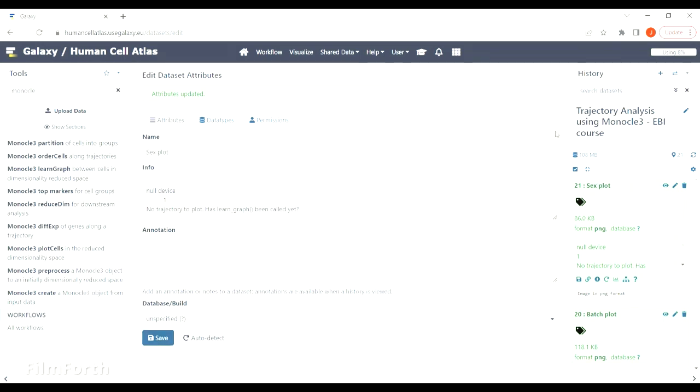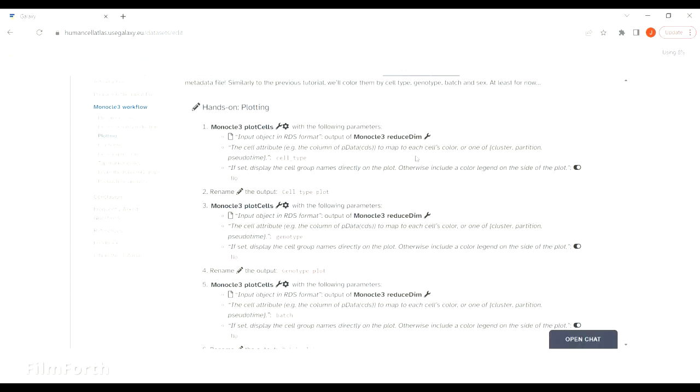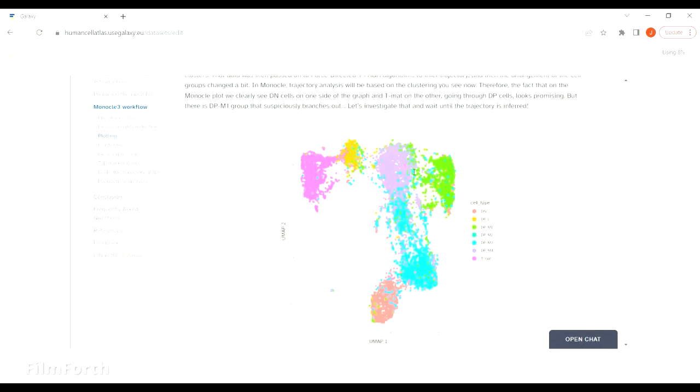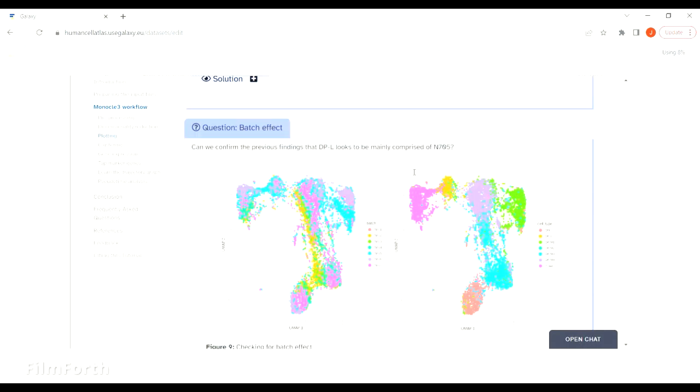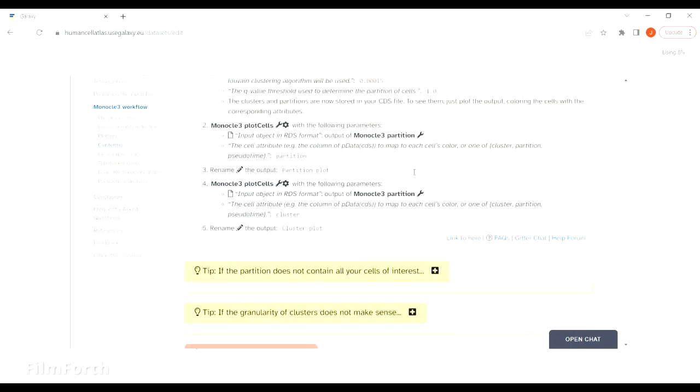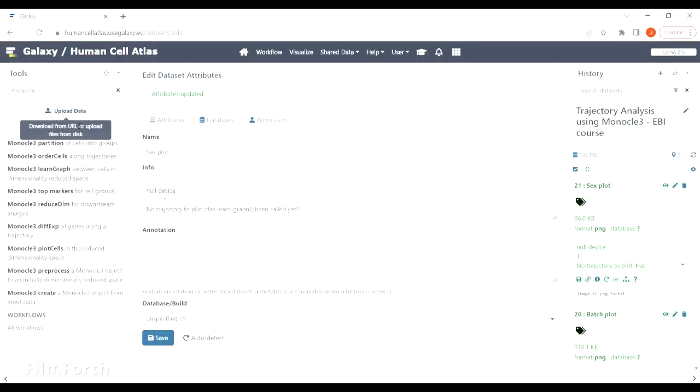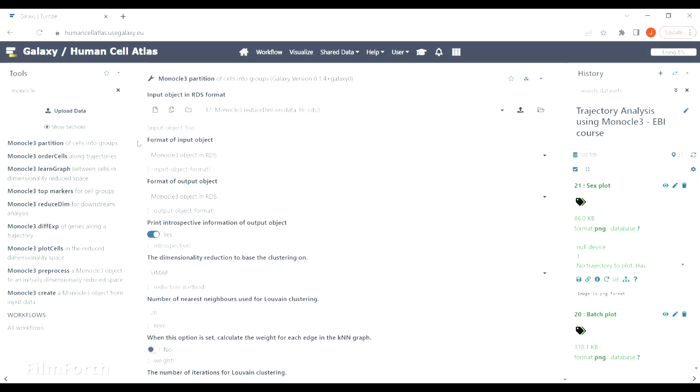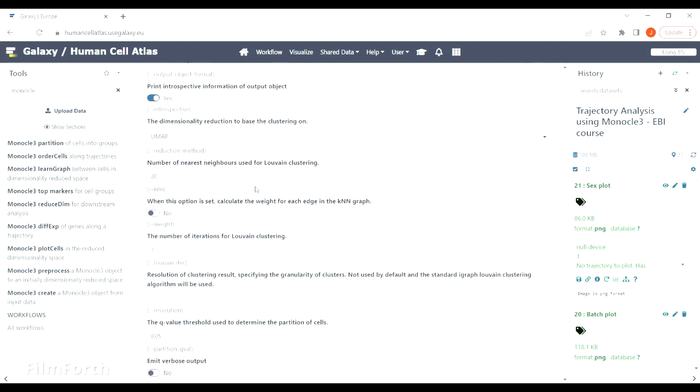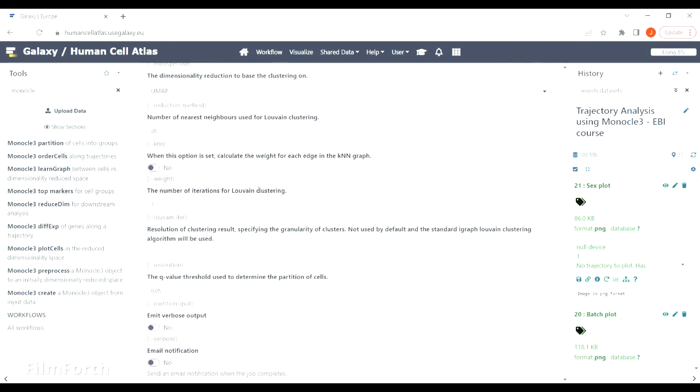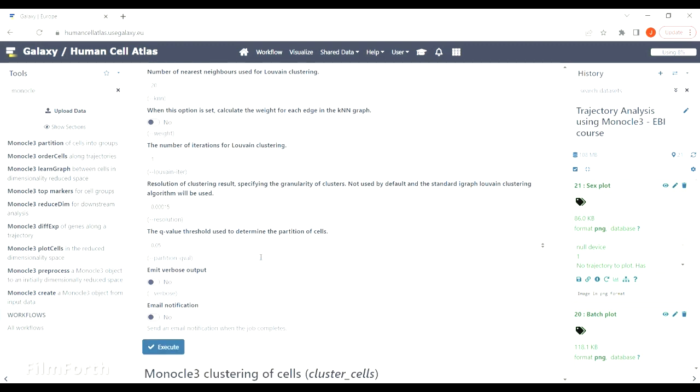The next step is clustering. We will assign cells to clusters and partitions. We will change the resolution value which corresponds to the granularity of the clusters and the R value which is related to partitions.